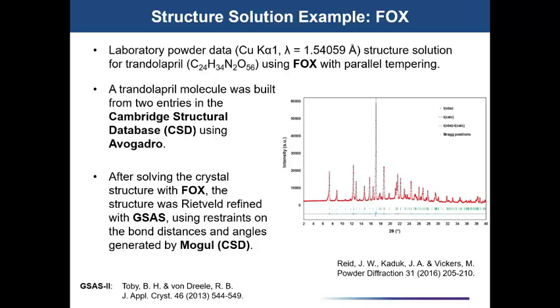So why would you ever bother to use reciprocal space data? There should be some advantage to it. It can be very quick. And with high quality data, with the type of data we encounter regularly, like on the low energy wiggler, very, very high resolution data, you can be successful that way. So yeah, the synchrotron definitely makes it easier. There are certain types of problems you only want to really try with synchrotron data because it's just going to be too hard with lab data. Both the resolution and the intensity matter. It's mostly the resolution. Yeah, getting rid of peak overlap as much as possible.